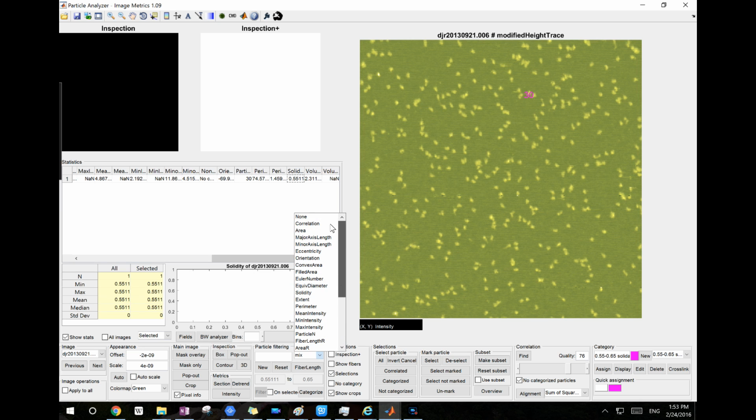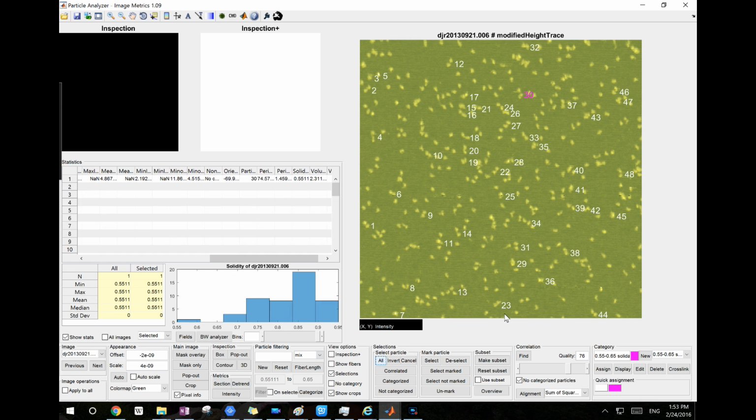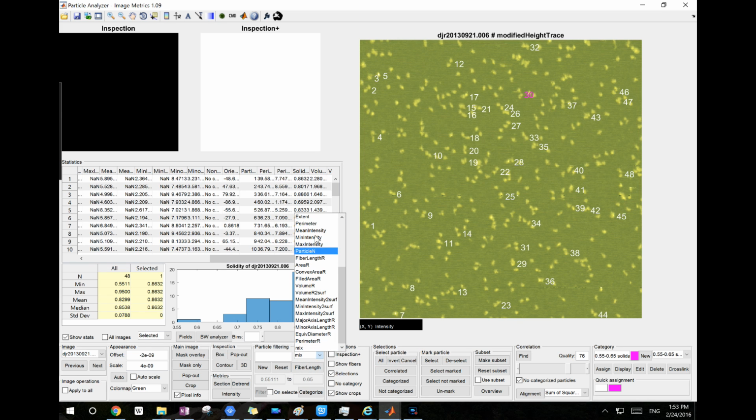Apparently the particles I originally got, these ones, are not categorized by region 1, which is only in the non-filter. The non-filter should not appear here. I was kind of stunned because I saw the non-filter appear when I made this new filter. So I guess that's kind of a bug, and I need to fix that.